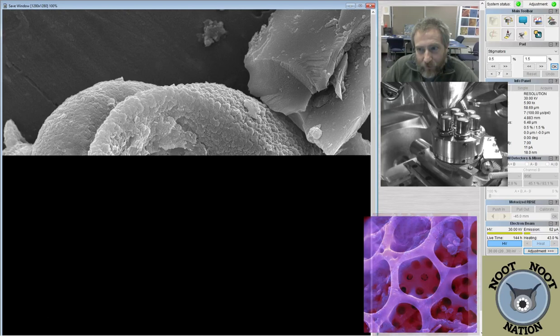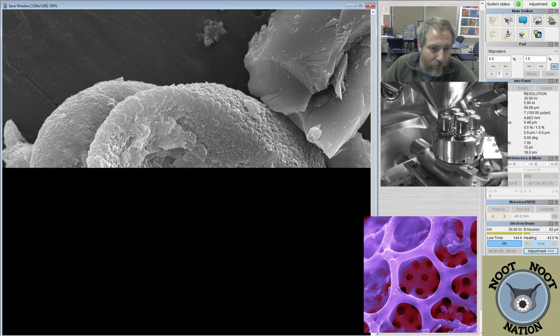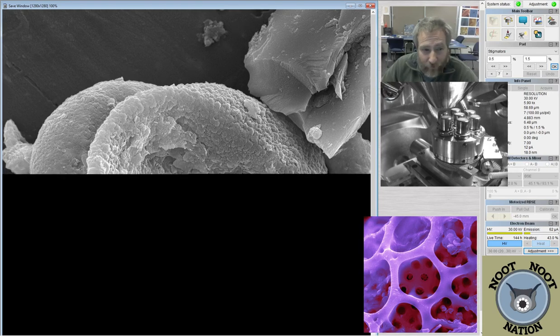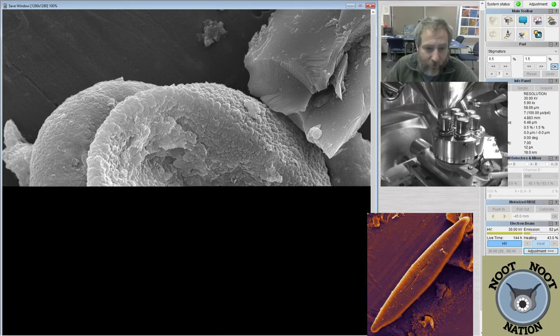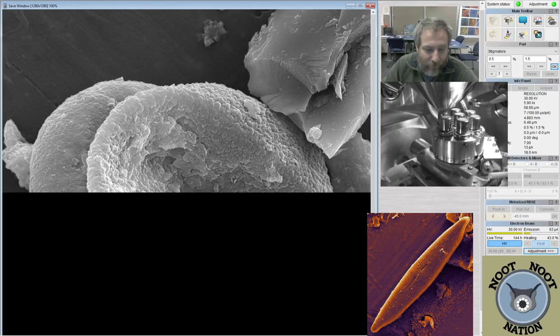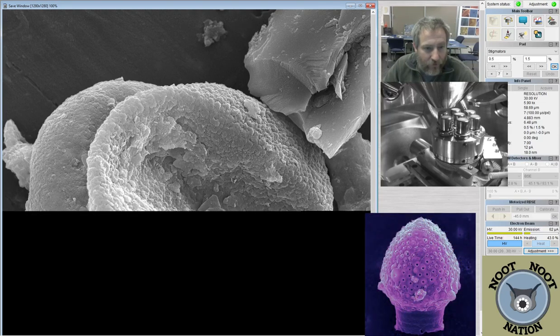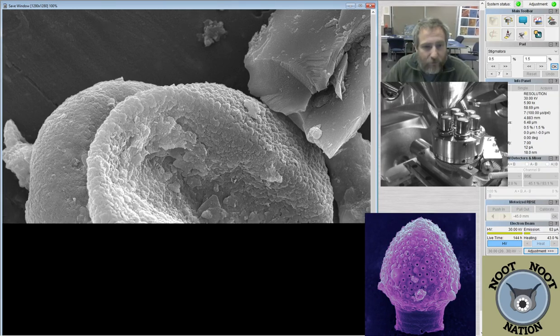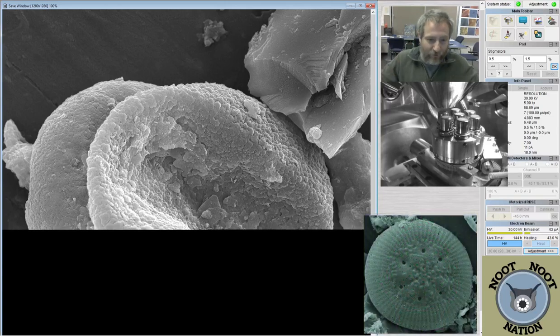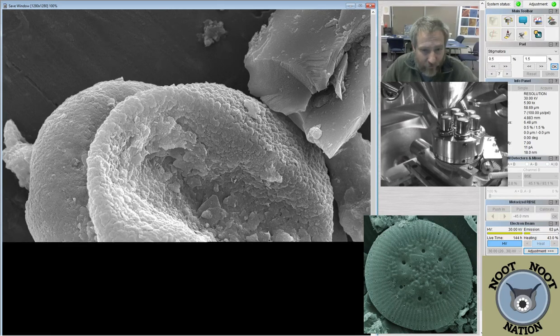So our image is being collected at 5,000 times magnification. And as I've mentioned before on the stream, a typical upright light microscope, if it has a 100x objective and 10x eyepieces, usually has a maximum magnification of about 1,000 times. You can enlarge that by putting 12x or 16x eyepieces on, but it doesn't actually make the image clearer, it just makes it bigger. So you could take anything and project it to a larger size. It doesn't necessarily mean that what you're seeing is any clearer.